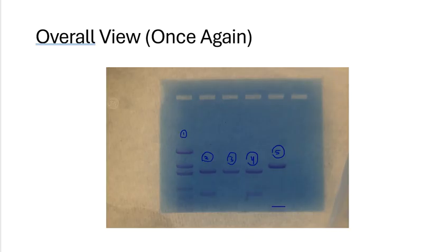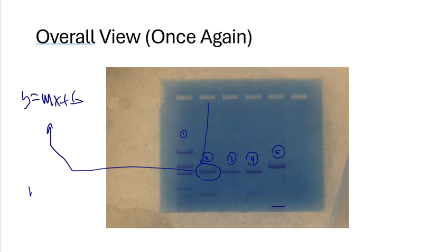That way, when we use these distances, we can talk about a y equals mx plus b regression line, and we are able to put in the distances that these fragments traveled, and we can plug those into the linear regression equation the proper way. We can then solve for the number of actual base pairs located in that band.